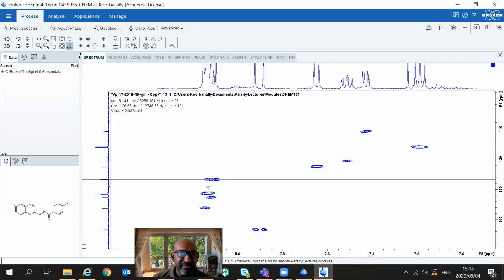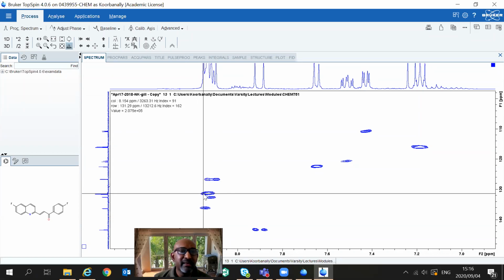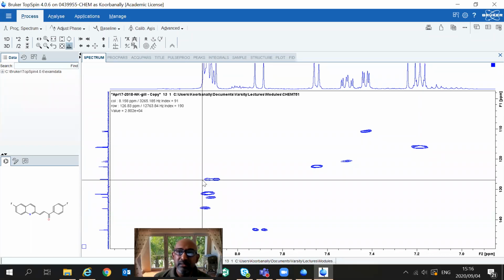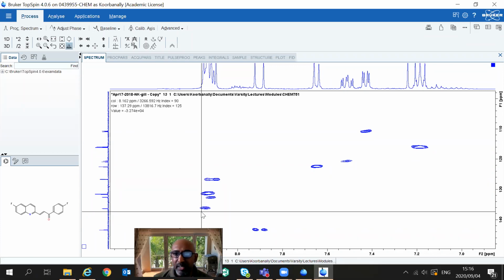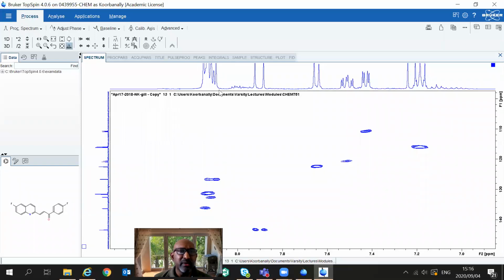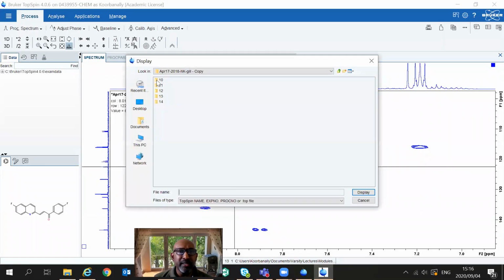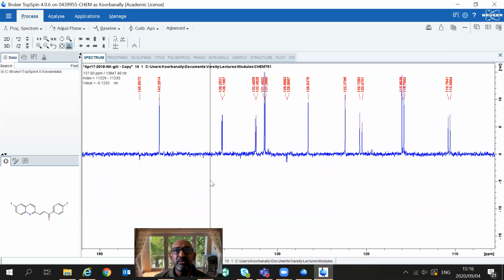And then the 5 carbons, what's on these 5 protons, or the carbons on these 5 protons, must be there, there, there, and there. Now you can actually look at this and you can say, okay, between 125 and 138 or so, I want to go back and look at the carbon for 125 and 138. Because what I can see now is that I have a bunch of things in here. But let me take you back to 135 and 128 and show you what else we can actually do and what's actually quite neat. Right, so remember I said we can expand this region.